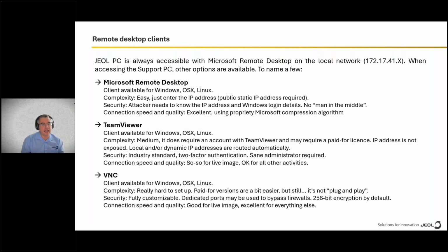Normally, computers that have public and static IP addresses do not have the remote desktop login option available, because people can use a very simple brute force attack, basically keep sending different combinations of usernames and passwords and eventually get into that machine. It's now 2024, computers are fast, networks are fast. It would not take that long to compromise a computer exposed like this. So normally this is not encouraged.